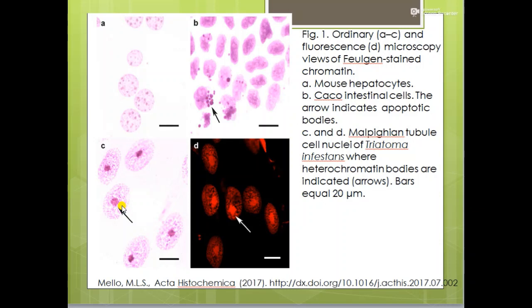That is, when staining is found to be more at a particular region, you will be able to see the presence of the nucleus. Here, heterochromatin, the thickened area of chromatin, can be found in this particular image. Now D is a fluorescence-based imaging. I'm not explaining that because it is not the core area of today's talk.